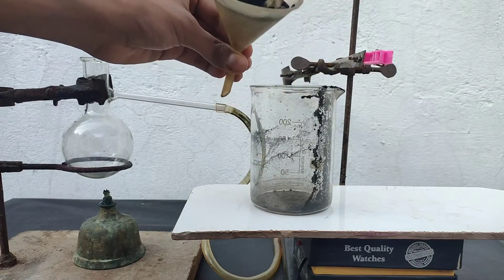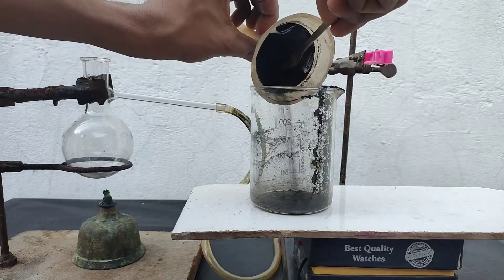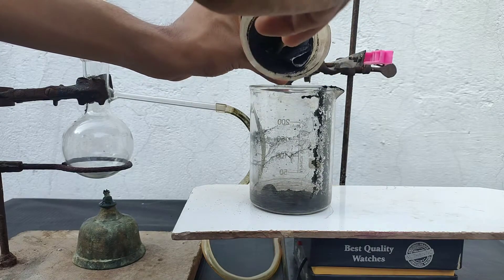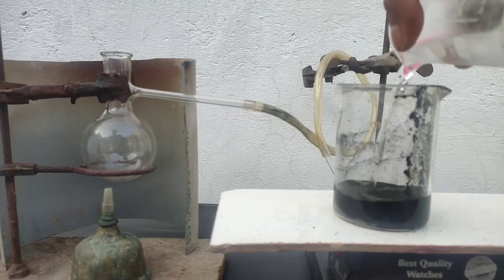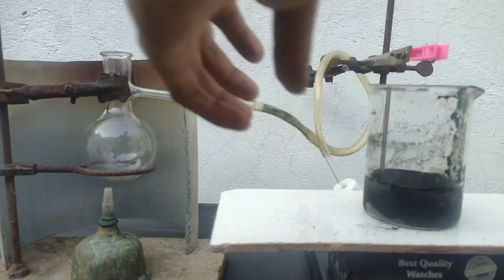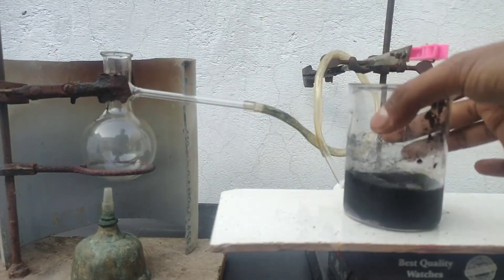I transferred all the precipitate into a beaker. The precipitate was somewhat dry since I was doing this the next day, so it came off easily with a spatula. To this, I am pouring chilled distilled water. Now we need to bubble sulfur dioxide gas into this suspension, as sulfur dioxide will react with manganese dioxide to form manganese sulfate, which is soluble. For that, we need to prepare sulfur dioxide.